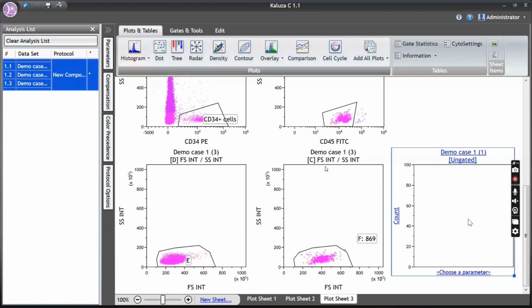Where are the beads? As I said, beads will show high fluorescence with maximum intensity, so it will be somewhere hitting the ceiling. It will be so bright. So let's check where the beads are now.